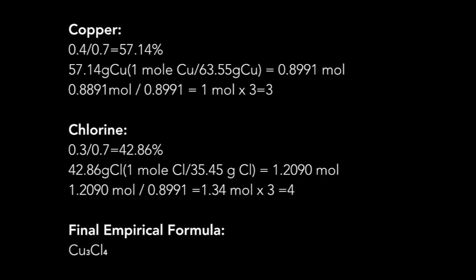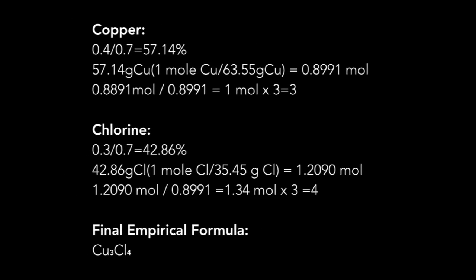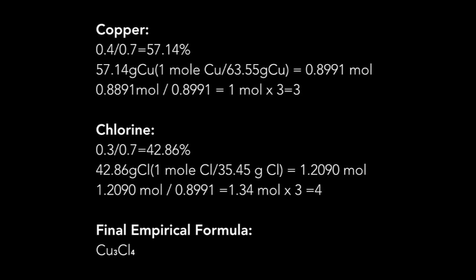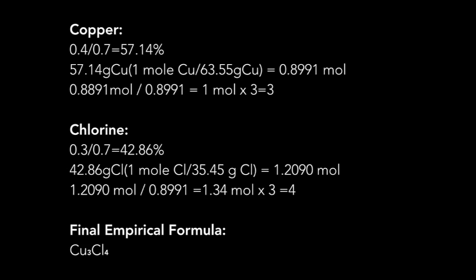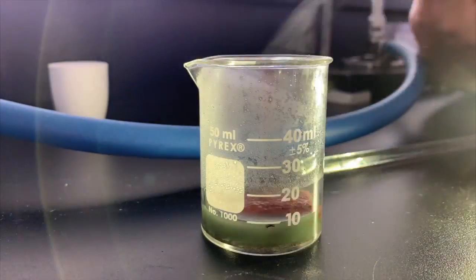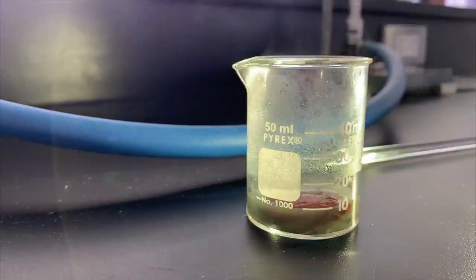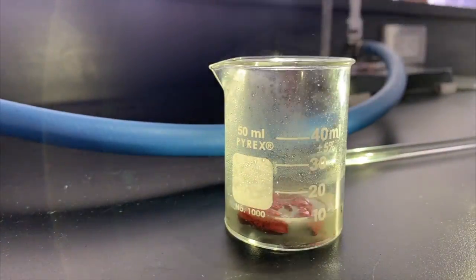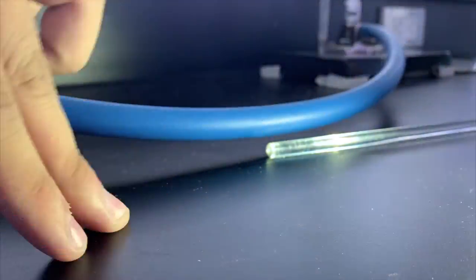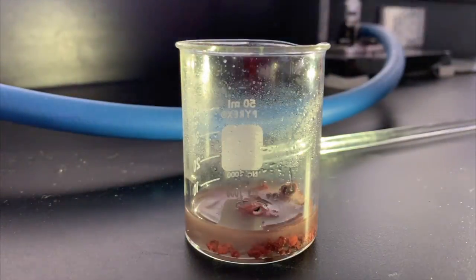The final result is ultimately affected by weighing the materials, contents, and the like, which are part of the experiment. This enables one to obtain the closest possible idea of the unknown substance. By calculating the masses of the substances while utilizing simple subtraction, one can then garner accuracy. The chemical formula of the compound can be found by dividing each answer of moles by the smallest and multiplying until whole to complete the formula.